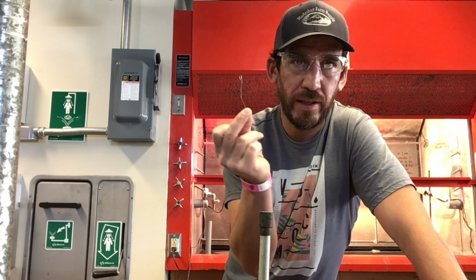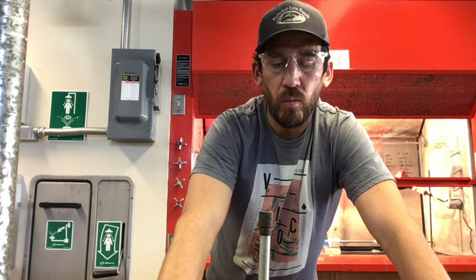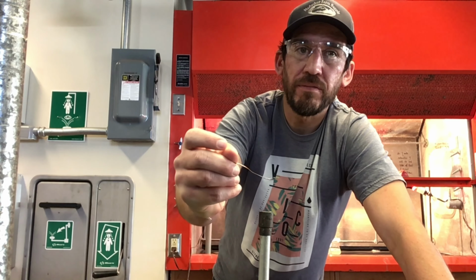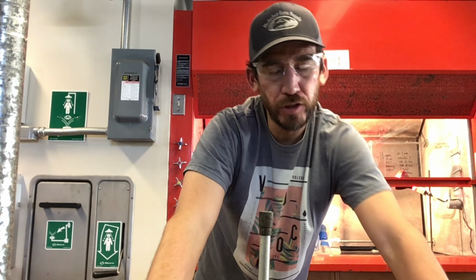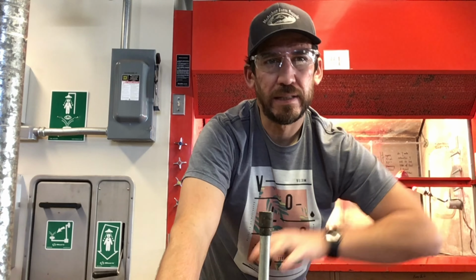Beilstein, pretty much the same. What I got here is a little copper wire. You see it? Right here. And I just kind of made a little loop at the end, and we're gonna dip it in some sample, put it in the flame of the Bunsen burner. If it burns green, what that means is that we have a halogen present in that compound. It doesn't specify whether it's chlorine, iodine, fluorine, or bromine or anything, but it does tell us we have a halogen. So this is really useful if we've kind of narrowed it down to a compound that does have a halogen and one that doesn't, right?